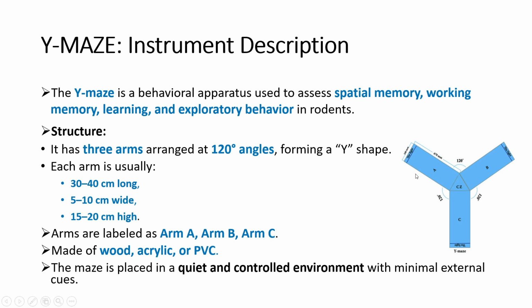It is made up of wood, acrylic or PVC. The maze is placed in a quiet and controlled environment with minimal external cues. So you have to conduct the experiment in a separate area.